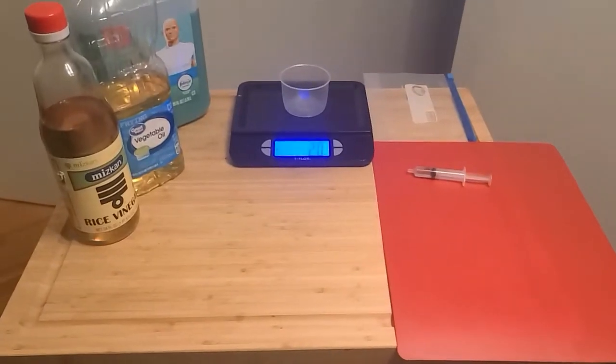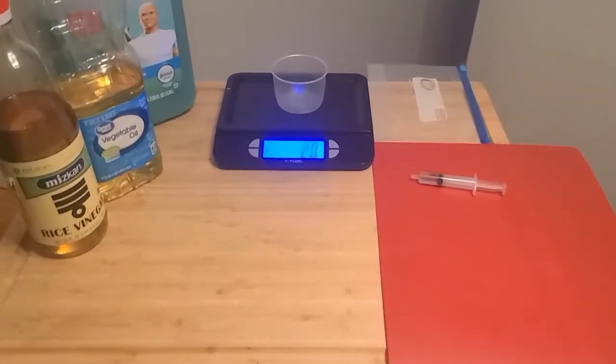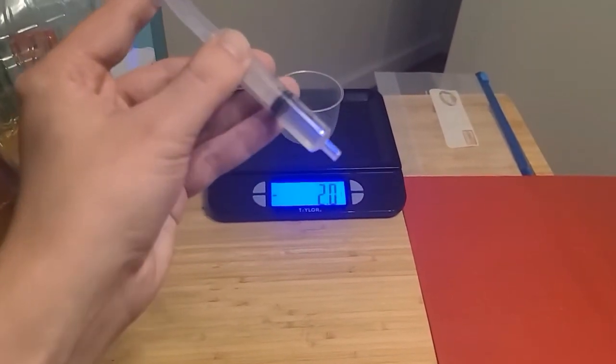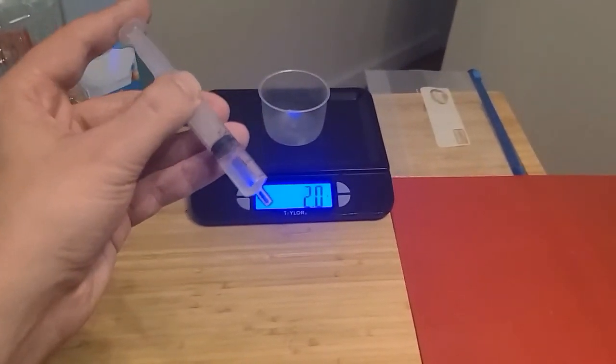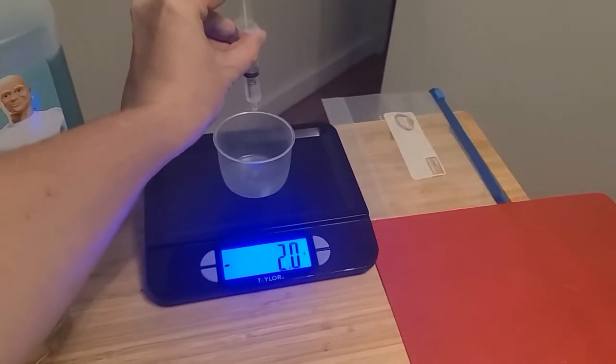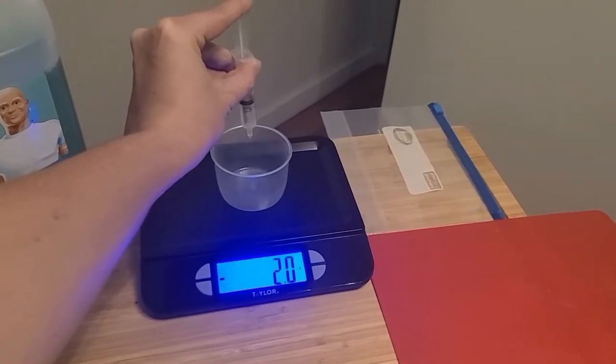Okay, so this is everything that I'm using. One of the most important parts of this is determining the surface tension. To do that, I'm basically just going to take this syringe and very slowly drop into the balance.